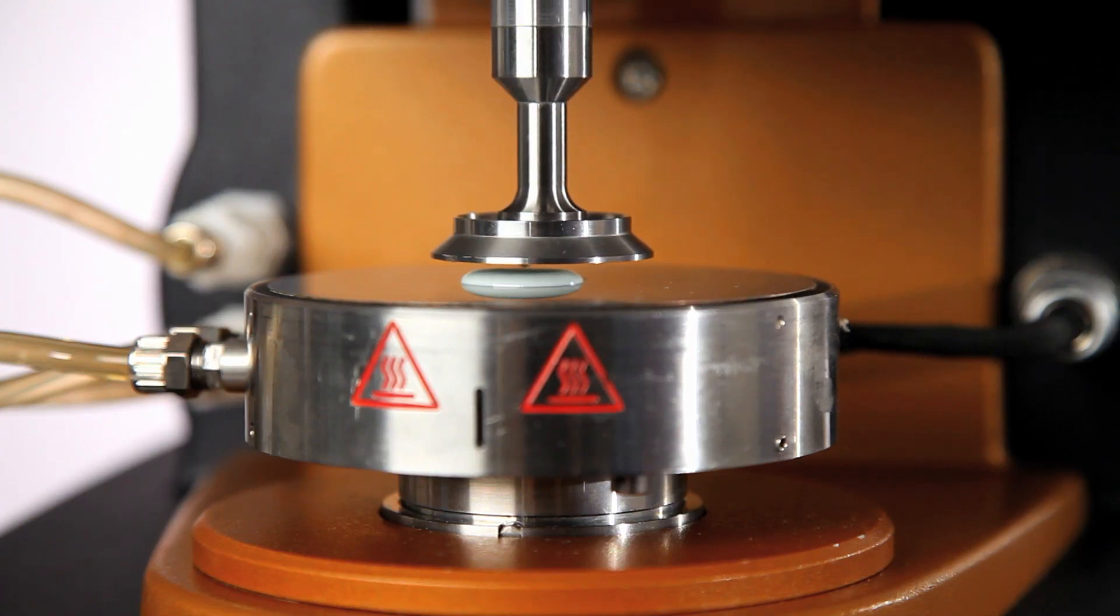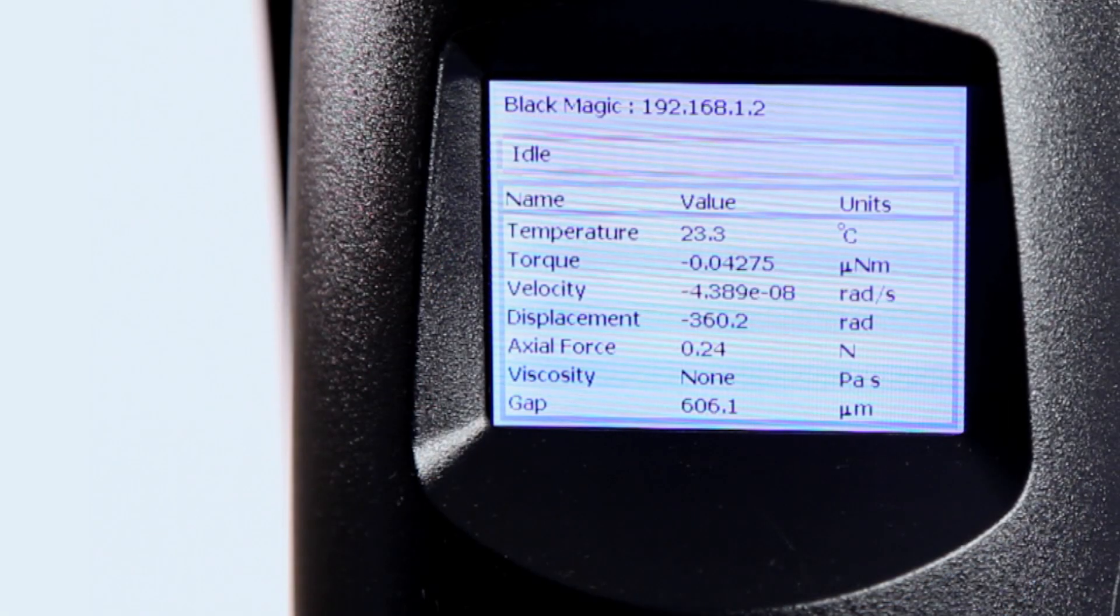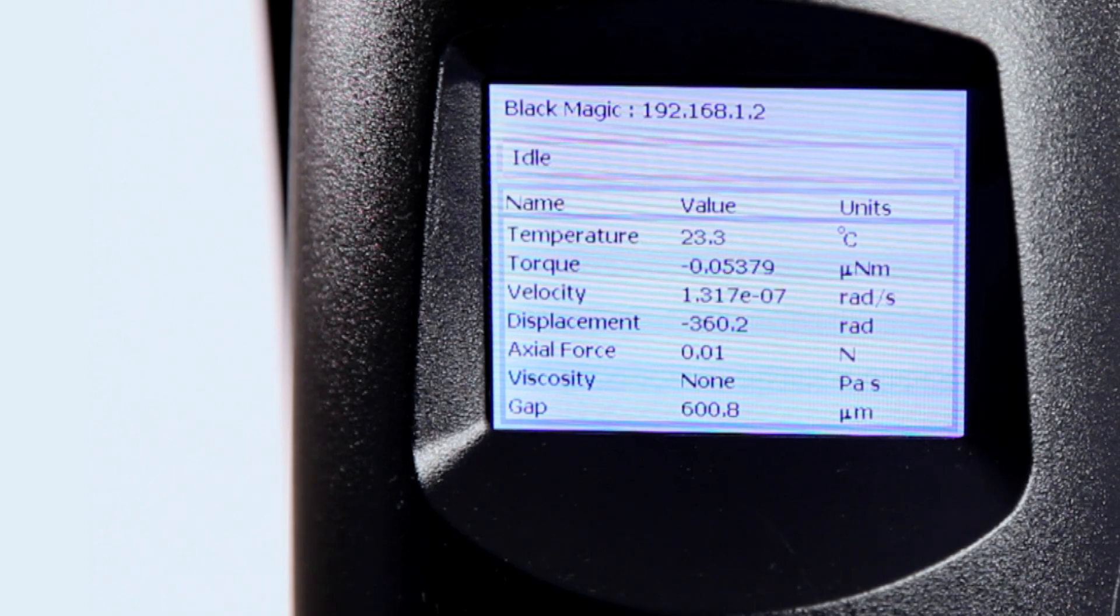When too little of a sample is loaded there will be an incorrect area for the stress calculation. Because of this the resulting viscosity or modulus values would be incorrect.